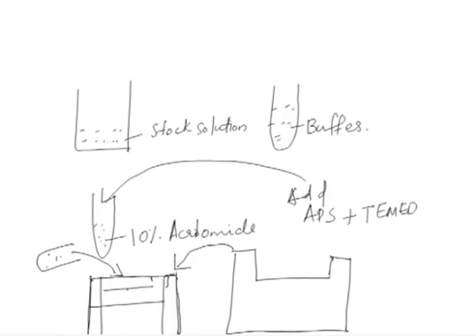Now, if it is a single gel, like only resolving gel, you will pour it to the top. If it is a stacking gel and resolving gel, the resolving gel will be put first, say up to this height, and then the stacking gel will be put in here. All right. So, this we will be discussing later on.